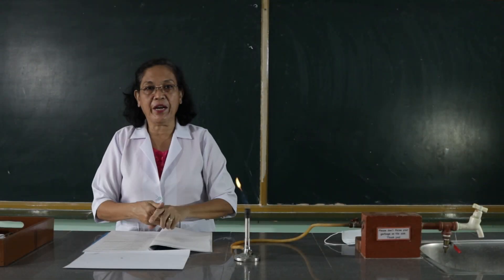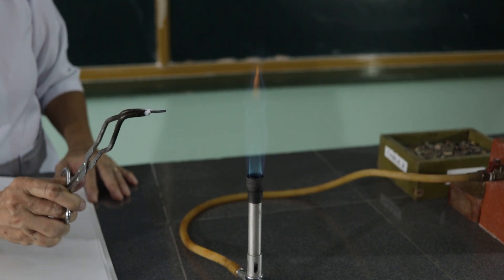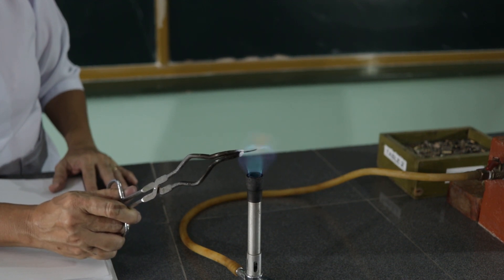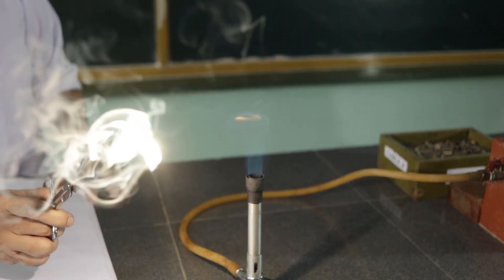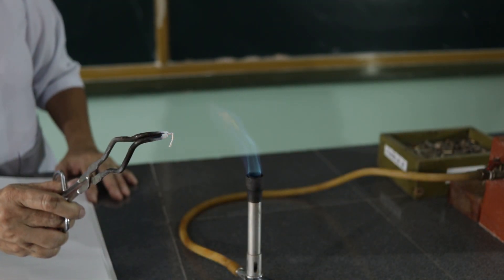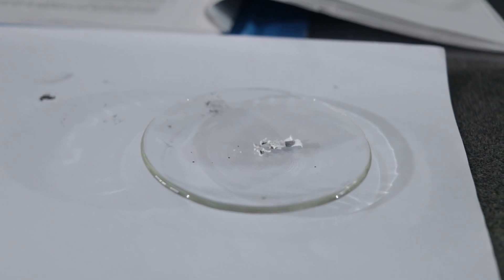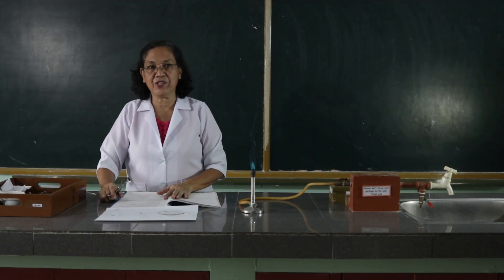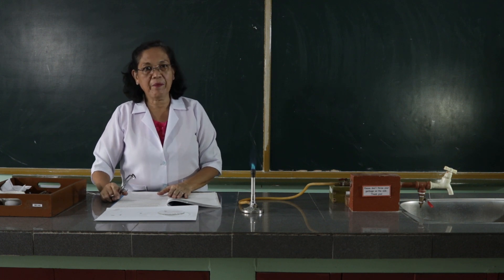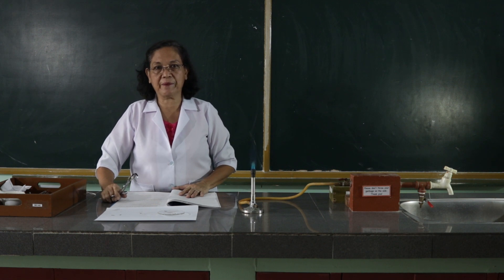The next procedure is, we are going to ignite the magnesium ribbon into this non-luminous flame. Let us ignite this magnesium ribbon into the non-luminous flame and observe. What have you observed? Look at the color of the ash after burning the magnesium ribbon. You are asked to write the chemical equation representing the reaction. Because this is magnesium being burned, the chemical reaction is magnesium plus oxygen equals magnesium oxide.